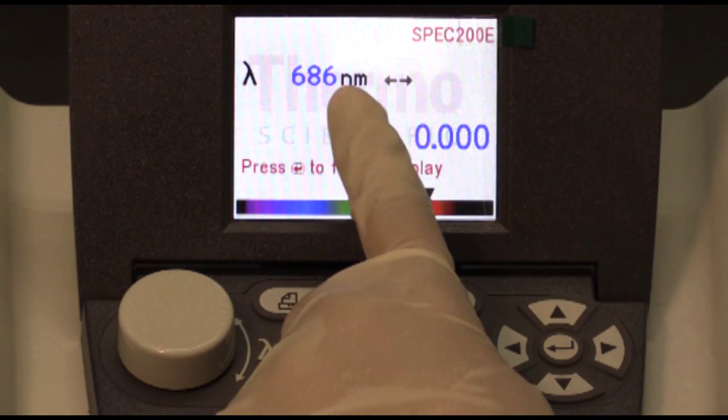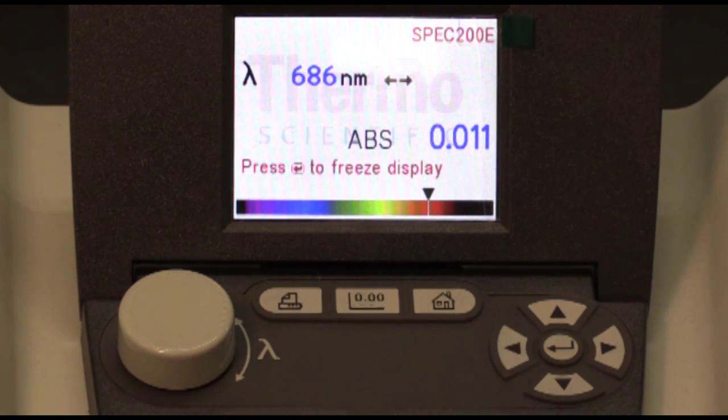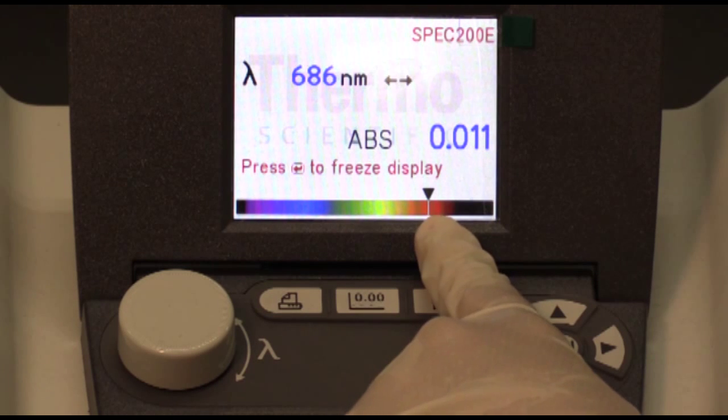Now your instrument is tuned to 686 nanometers, which is in the red region of light.